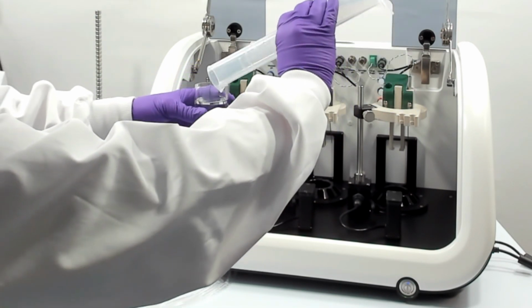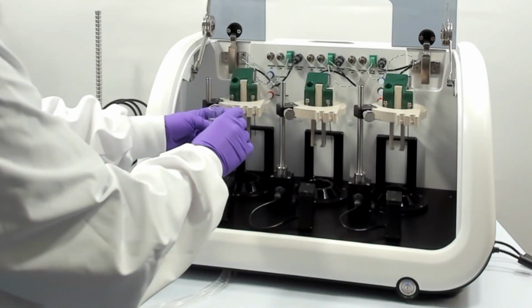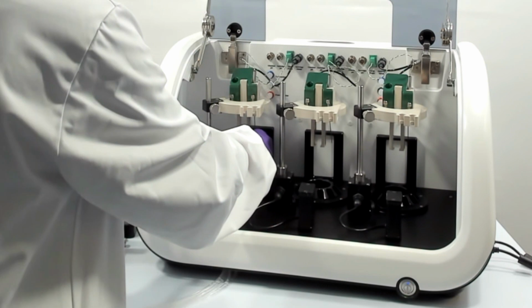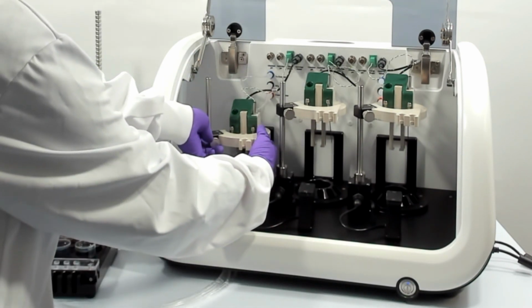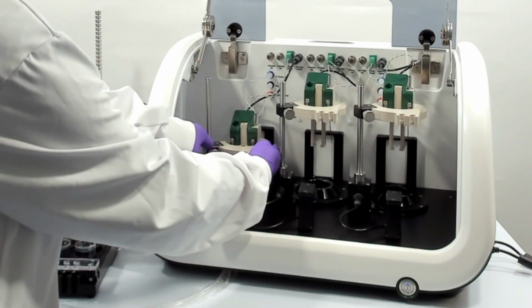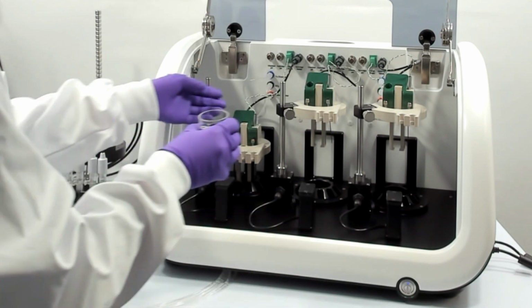With the stirring action and the external flow rate, we have a good mixing of the external fluid inside the chamber, allowing that environment to remain homogeneous so that we can quantify how much of our API actually is released from our cartridge to our outer chamber over time.